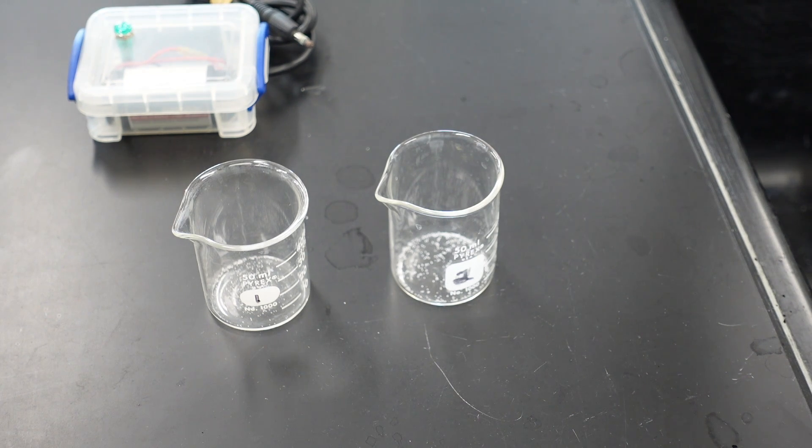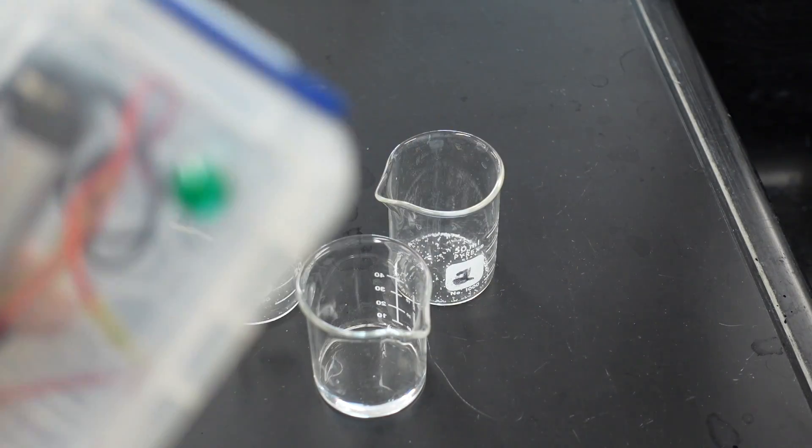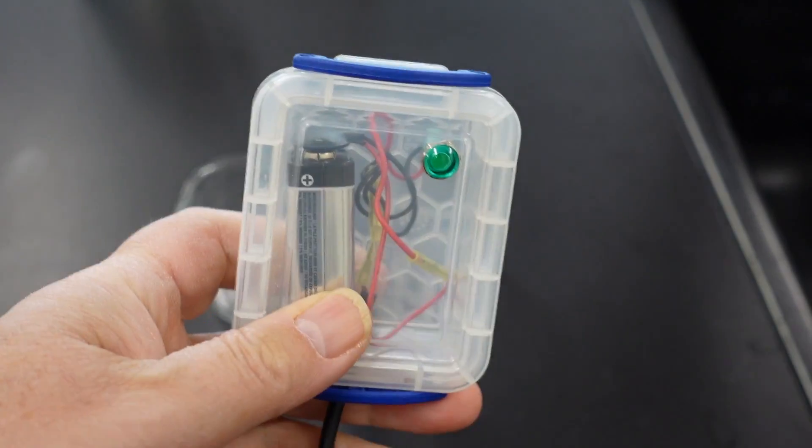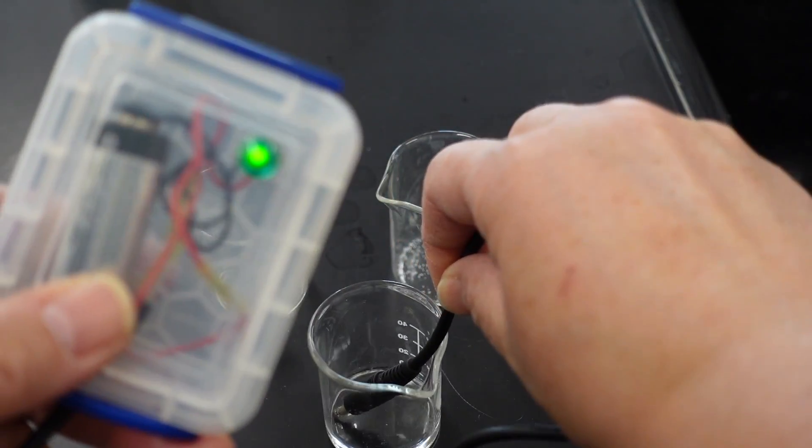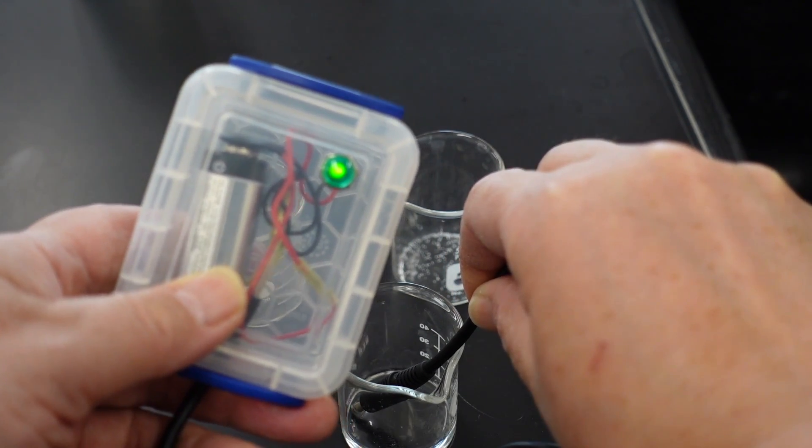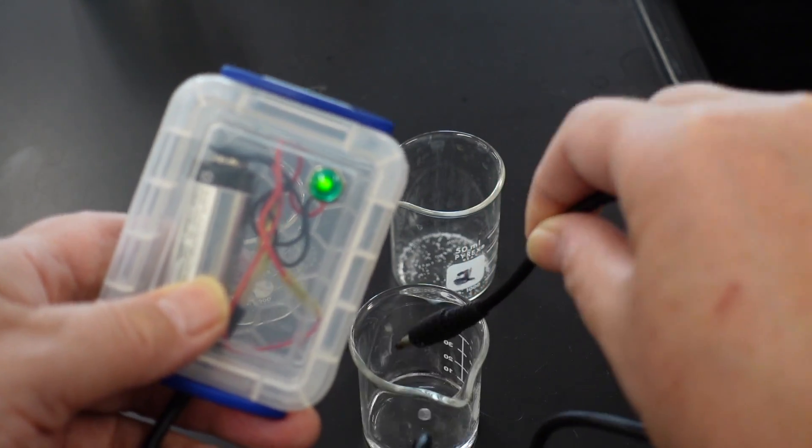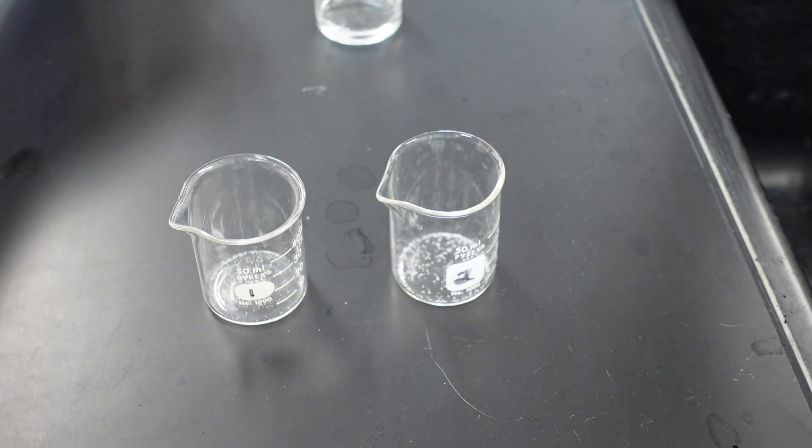And now we are going to test their conductivities. But first, let's see what the conductivity of distilled water is without having anything dissolved in it. The conductivity tester's light will glow if it conducts electricity. If it only glows a little bit, then it's a poor conductor of electricity. If it glows brightly, then it's a strong conductor of electricity. That would be a dim glow. So that's what you would expect from a poor conductor.